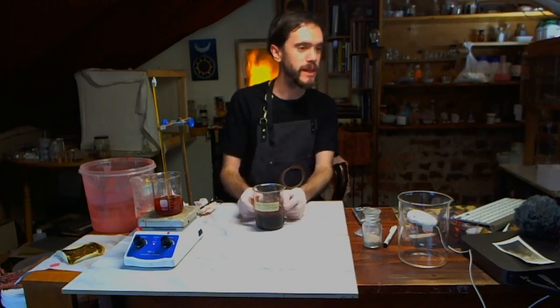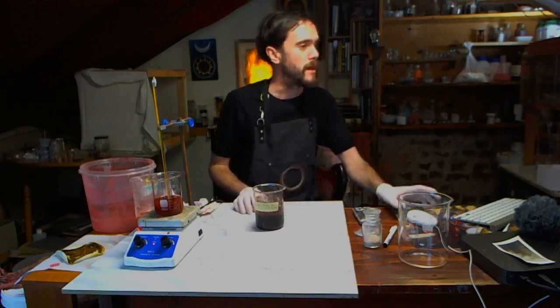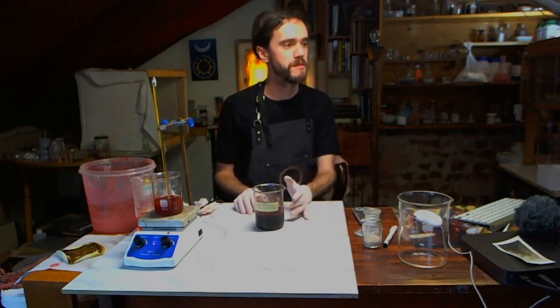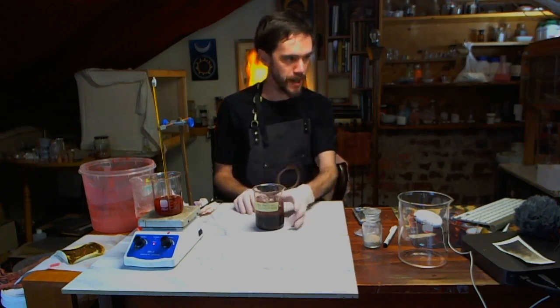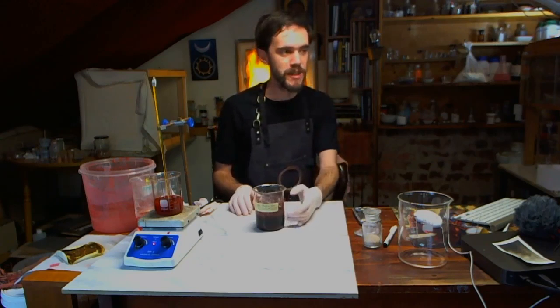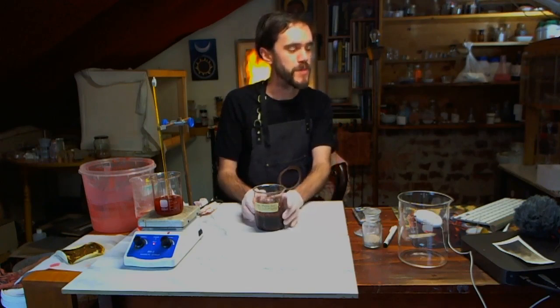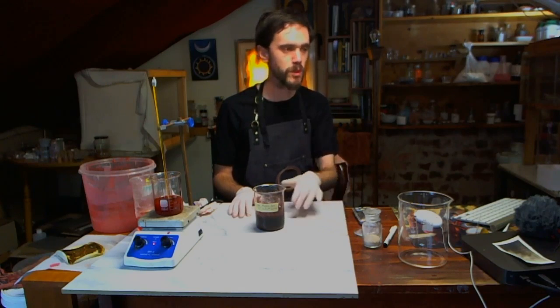So yeah, this method I'm doing here was from the Artist Pigments Volume 3. And so it says here, since alizarin and purpurin, the two main components of madder, are insoluble in cold alkali sulfates, you take 1 kilo of madder, which I've done 10 grams here, or 9 grams, I think, to be specific, and you leave that for 12 hours in a solution of sodium sulfate. So they said 1 kilo of sodium sulfate in 12 liters of water.